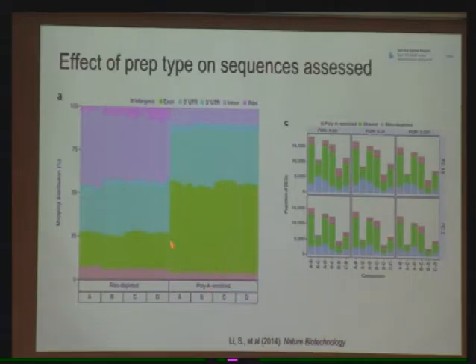But look at the coverage of exons, that's different. That's a really big difference there. So a lot of the time when we're doing RNA-seq, we're interested in quantitating protein coding genes and their exons. So this is the main data that we're going to use to do that. And note that the amount that you get varies a lot between these two protocols.